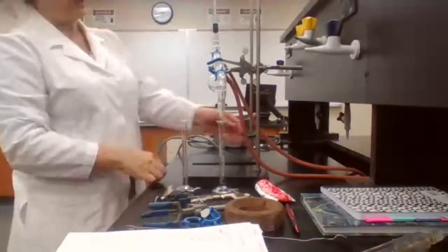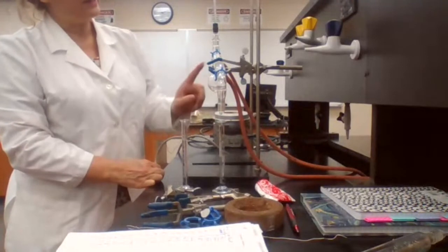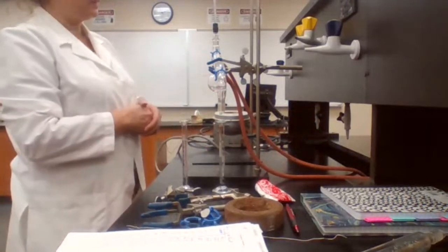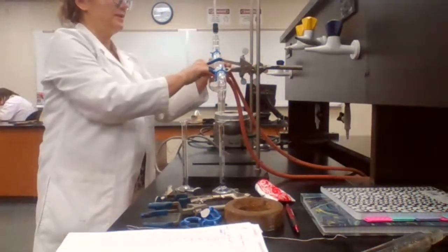To separate the water, you have to first unplug the hose from the faucet and let the water drain from the lower end and then separate it. Because when it's full, you don't want to separate it while it's full.